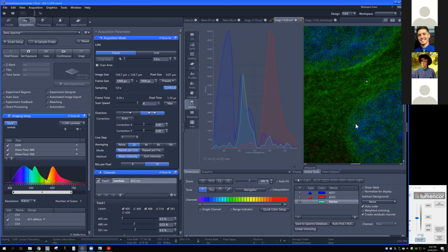Kind of noisy though, right? Our intensity here isn't as high. We're only looking at about 60% of the dynamic range in this case. And let me just create a different curve because I'm pretty happy with that for the moment. You can see that as I look across these, I can't really do much better than the one that I got. These aren't really much brighter.